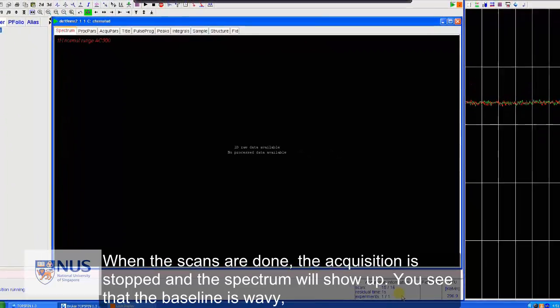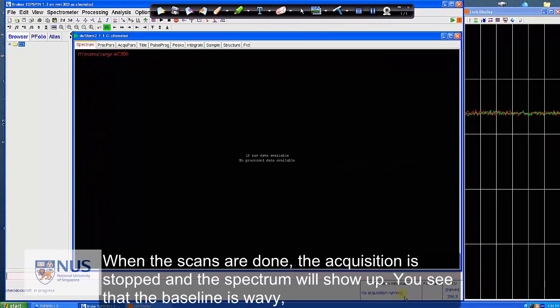When all the scans is run, the acquisition is stopped. And the spectrum will show up.